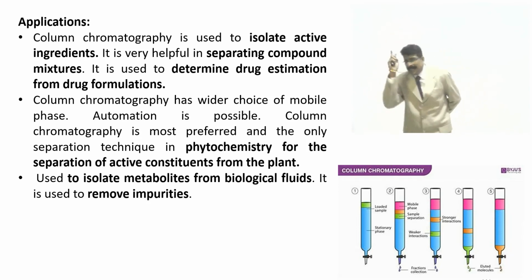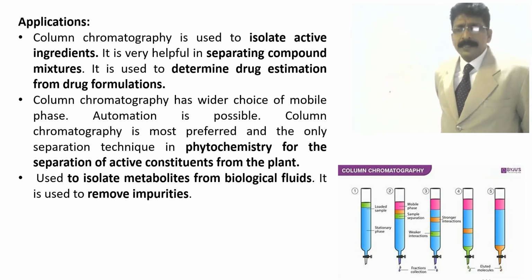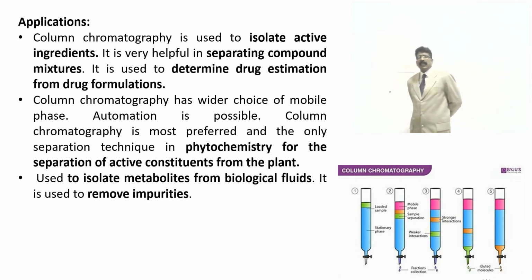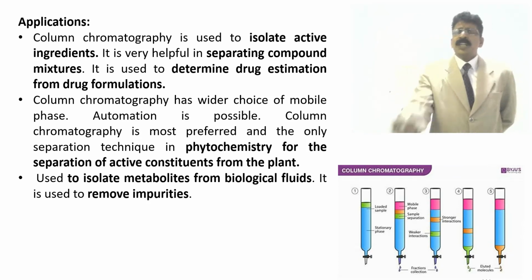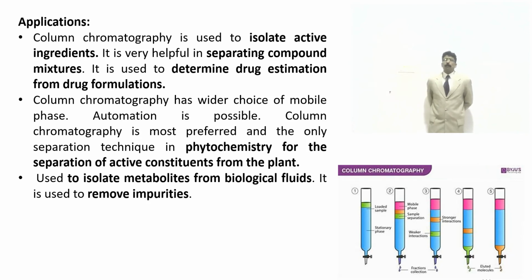And it's an initial technique which has to be done when you want to go for any type of project or research. It is a technique which you should not omit, neglect or ignore for your research purpose. That is what I very strongly used to say. It was totally because of some ego or some issues that they stopped column chromatography in their research. So the students have to remember the importance of column chromatography in phytochemistry and separation of active constituents from the plant.